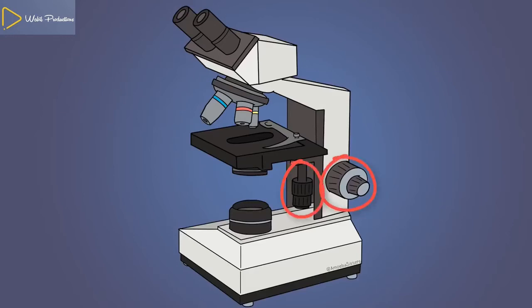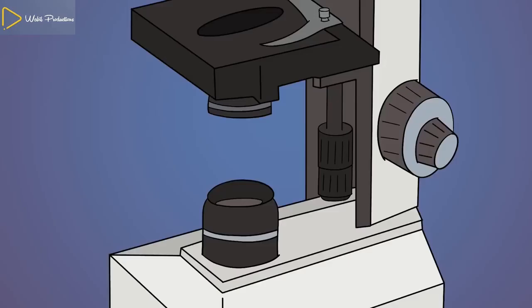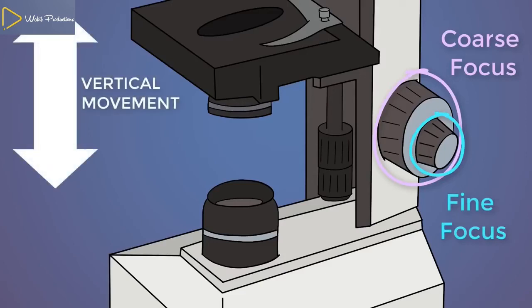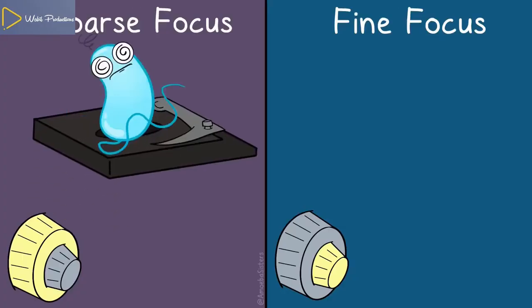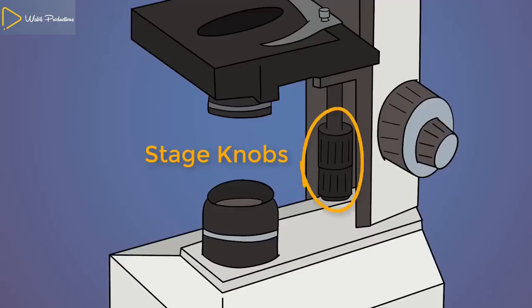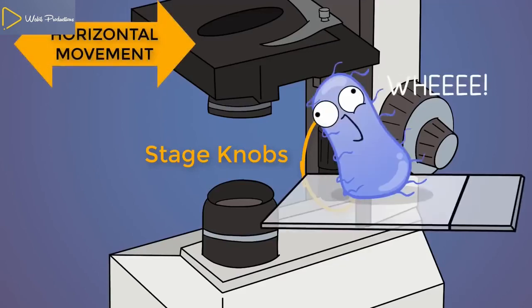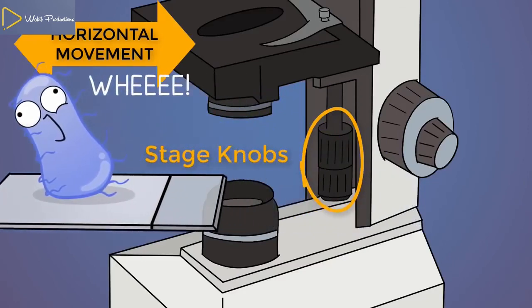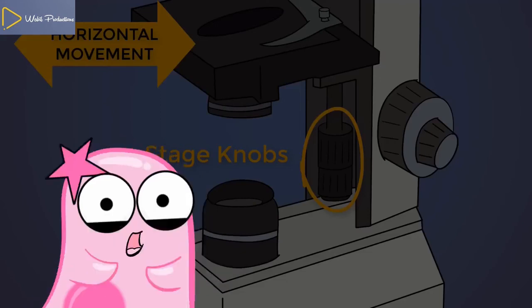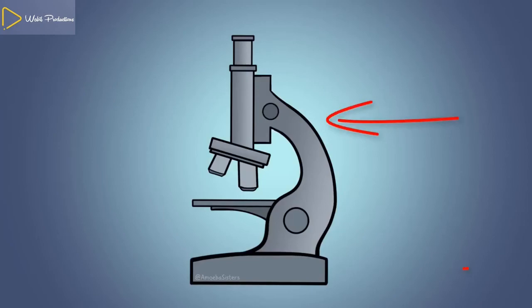You'll also notice there are a lot of knobs here. This large knob is known as the coarse focus, and this smaller knob is known as the fine focus. Both of these knobs raise or lower the stage, which helps with focusing. The coarse focus knob will move it more dramatically, whereas the fine focus knob moves it in smaller increments. These knobs — the stage knobs — don't move the stage up and down, but rather from side to side, helping you explore what's on the slide. Not all microscopes have stage knobs; sometimes you have to move the slide manually. This is the microscope arm and the base.